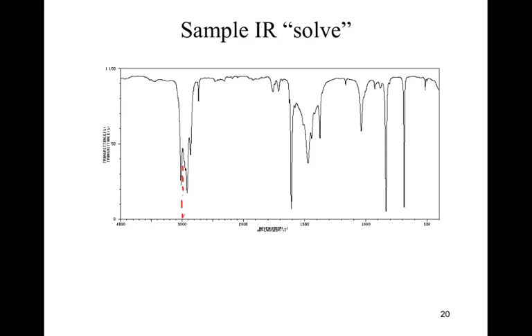Okay, my line shows that this peak is greater than 3000, that is an sp2 carbon-hydrogen stretch. This peak is just to the right of it, that is a carbon-hydrogen sp3. Very quick and easy labeling that. I see another sequence of peaks in here. And yes, it can be very tempting to go through and label those. But remember, this should be very superficial.